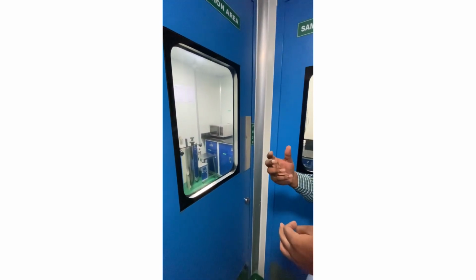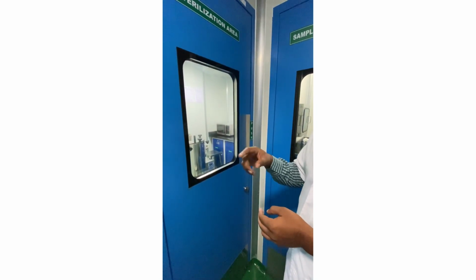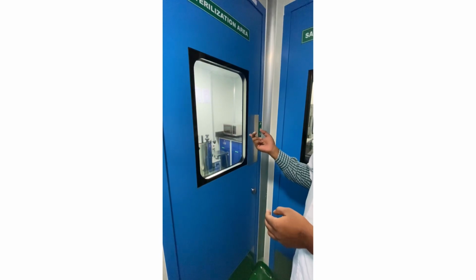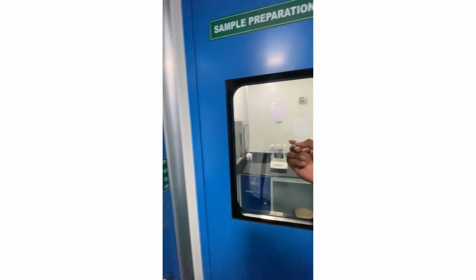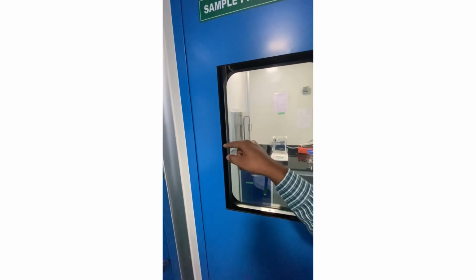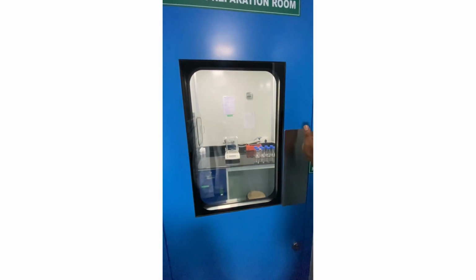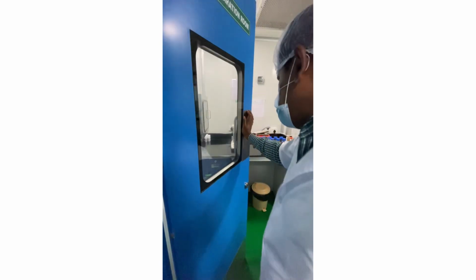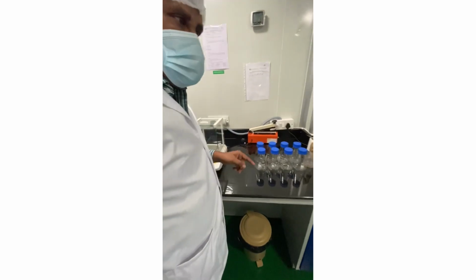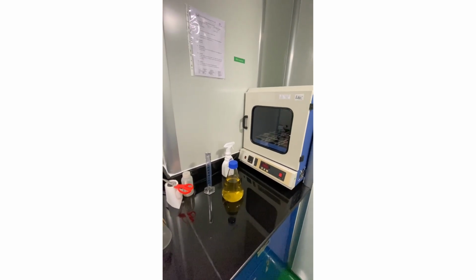So that no other contamination is there, we do sterilization at 121 degrees centigrade, 15 lbs pressure for 15 minutes. After sterilization, we take the media and glasswares through that pass box to the other side. This is the sample preparation room, used mainly only for sample preparation, no other activity is done here. After preparation of the sample here, we keep it for mixing with that equipment, like this.